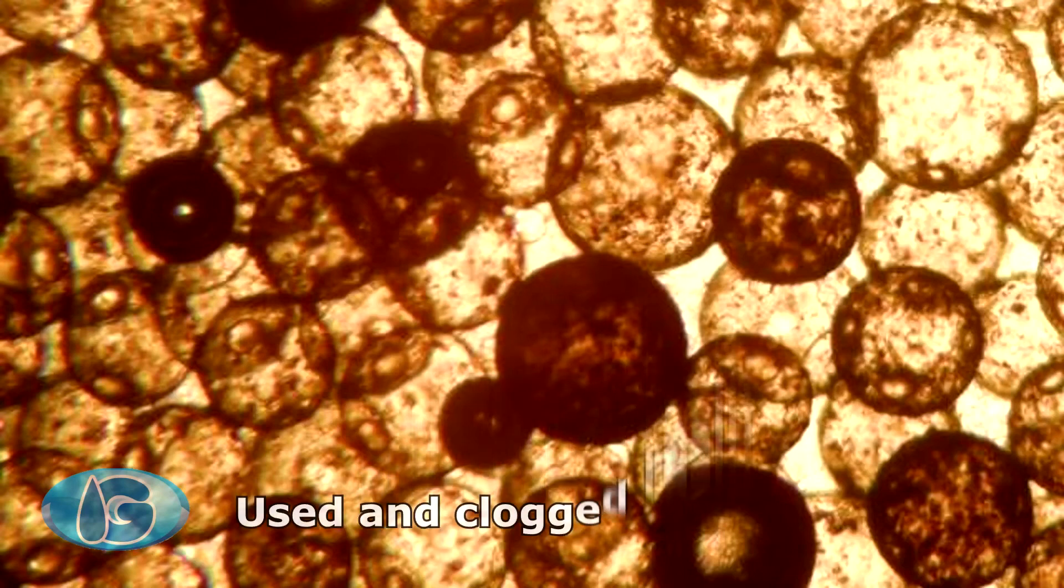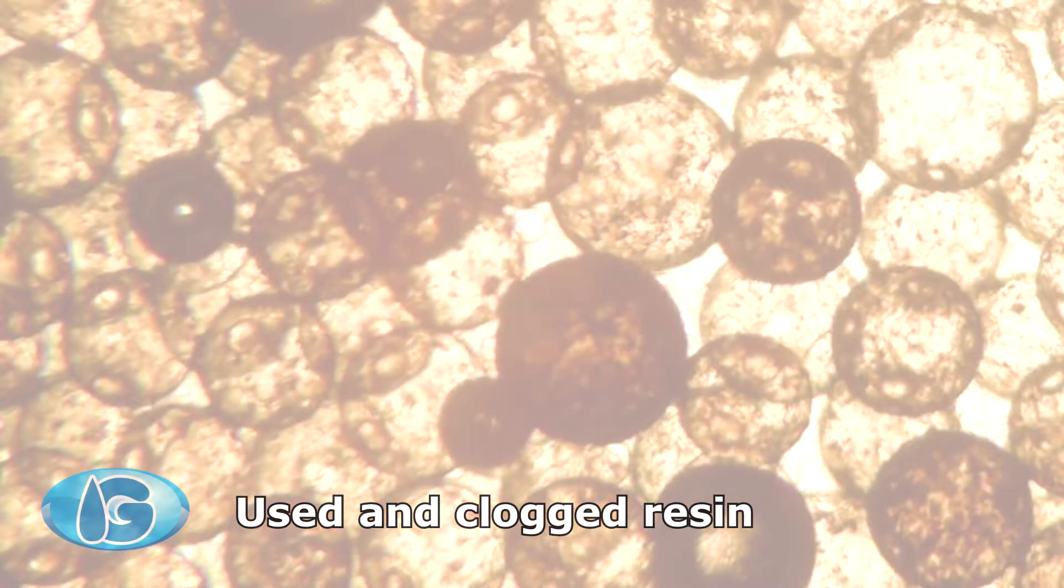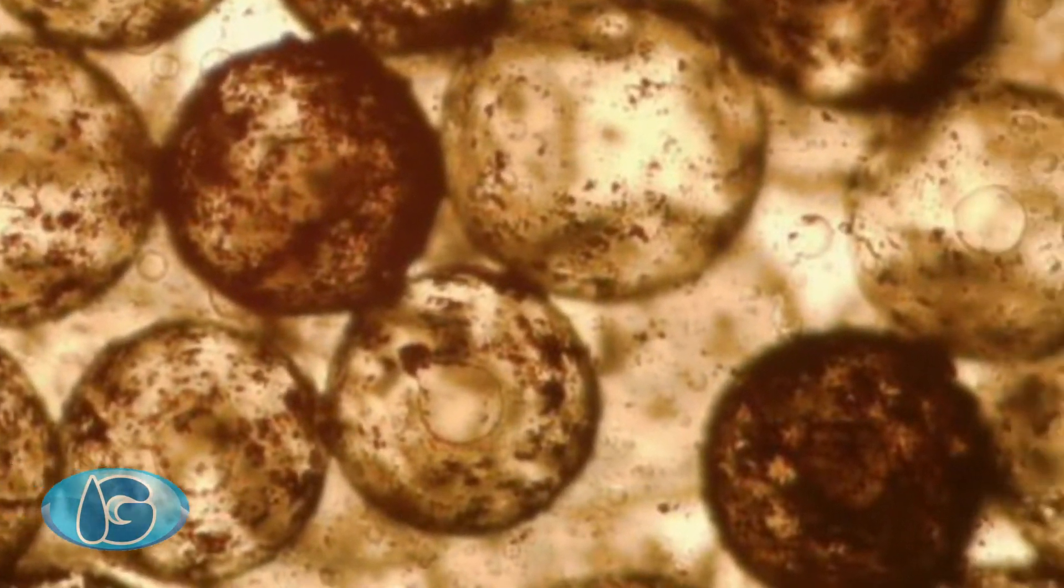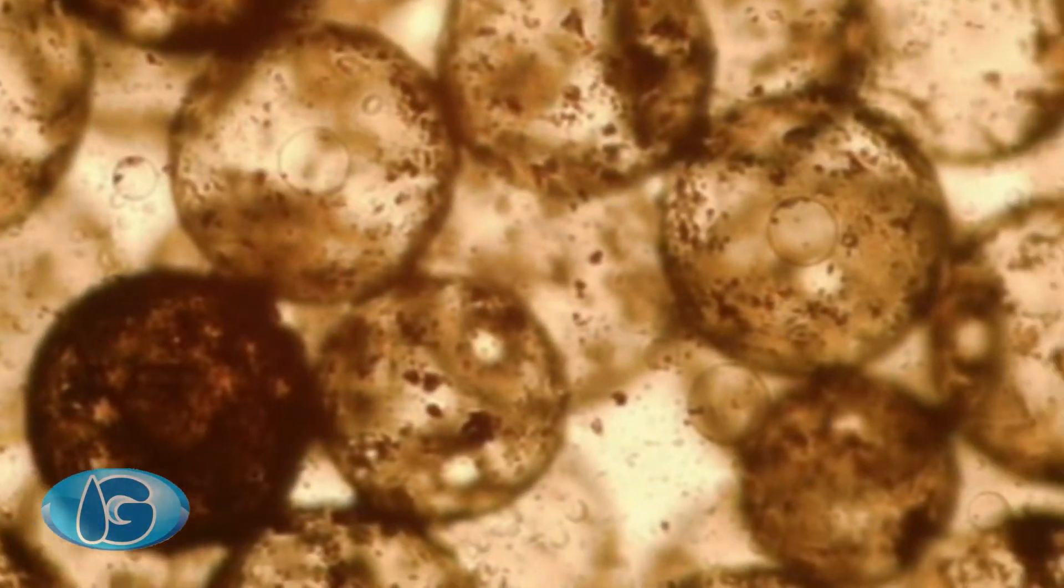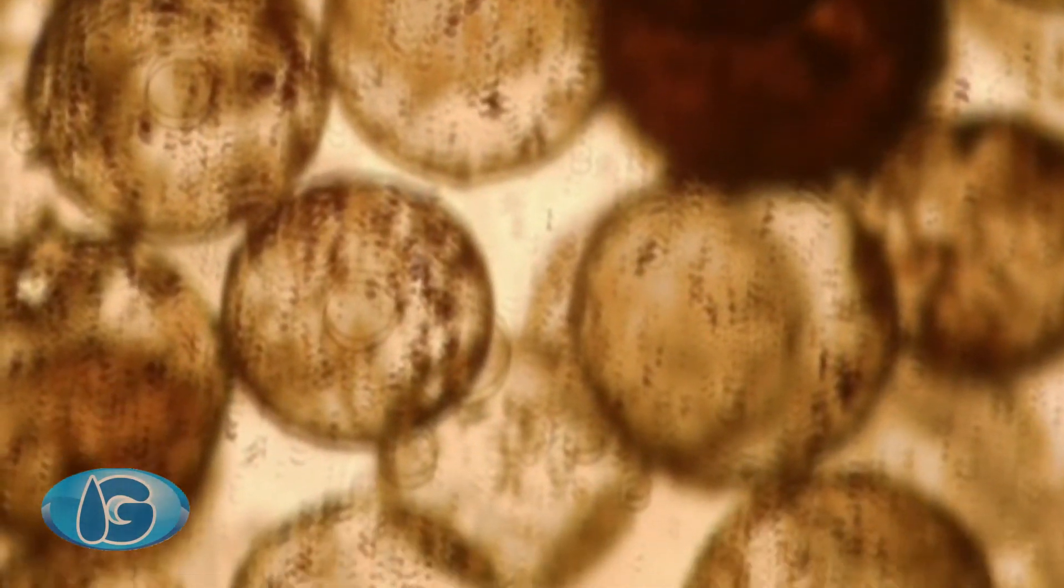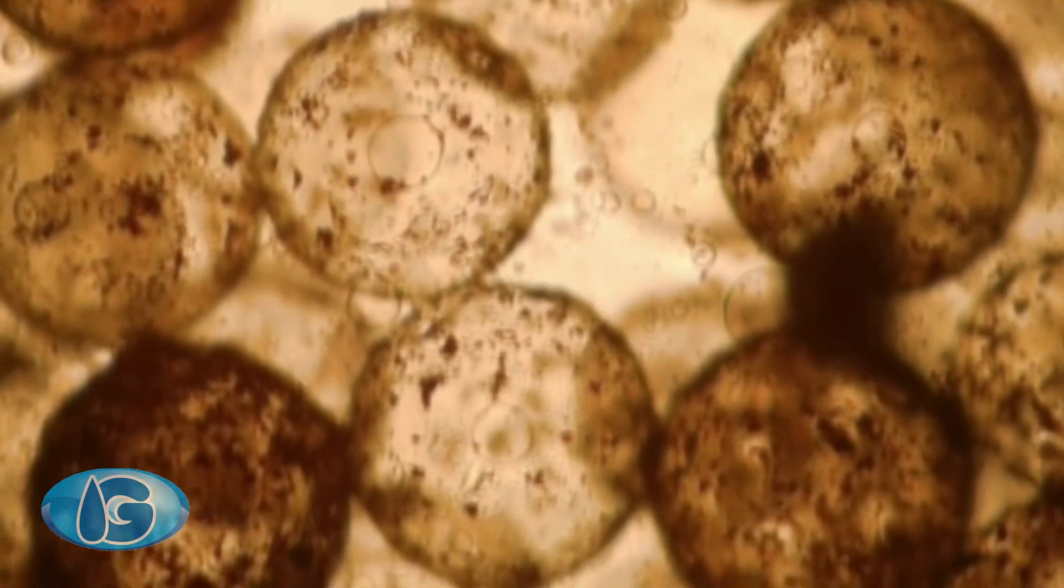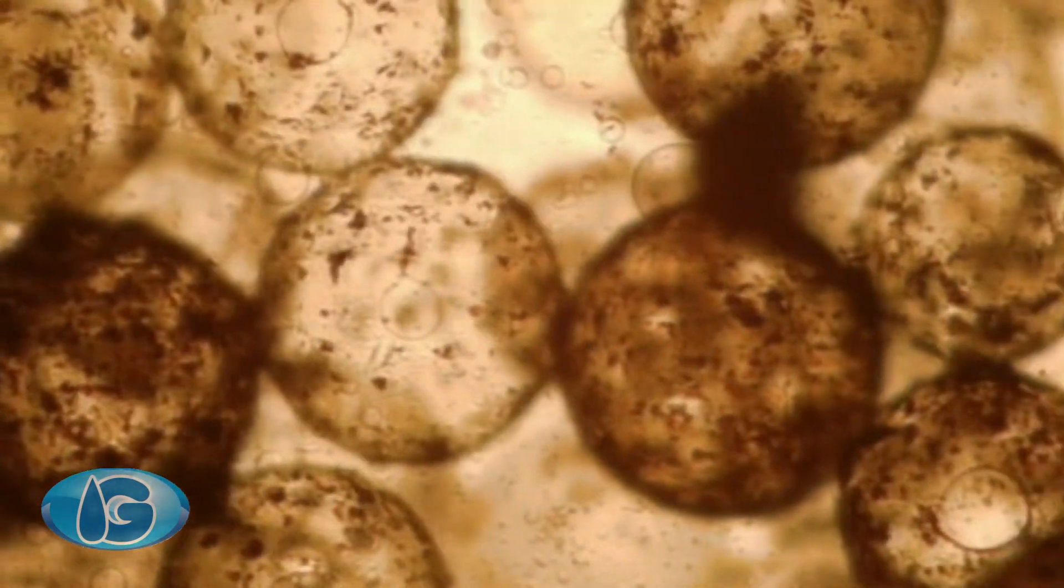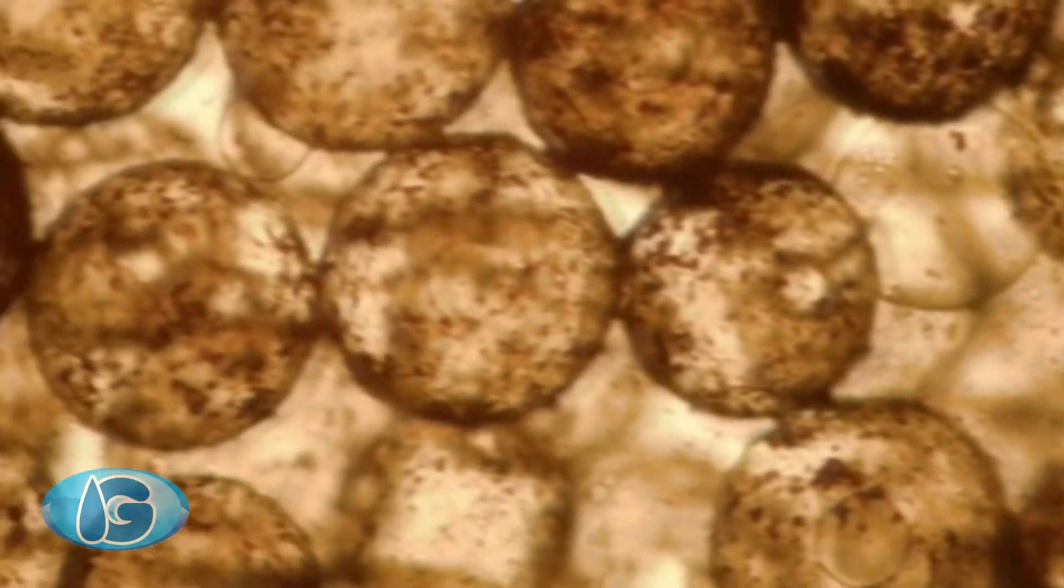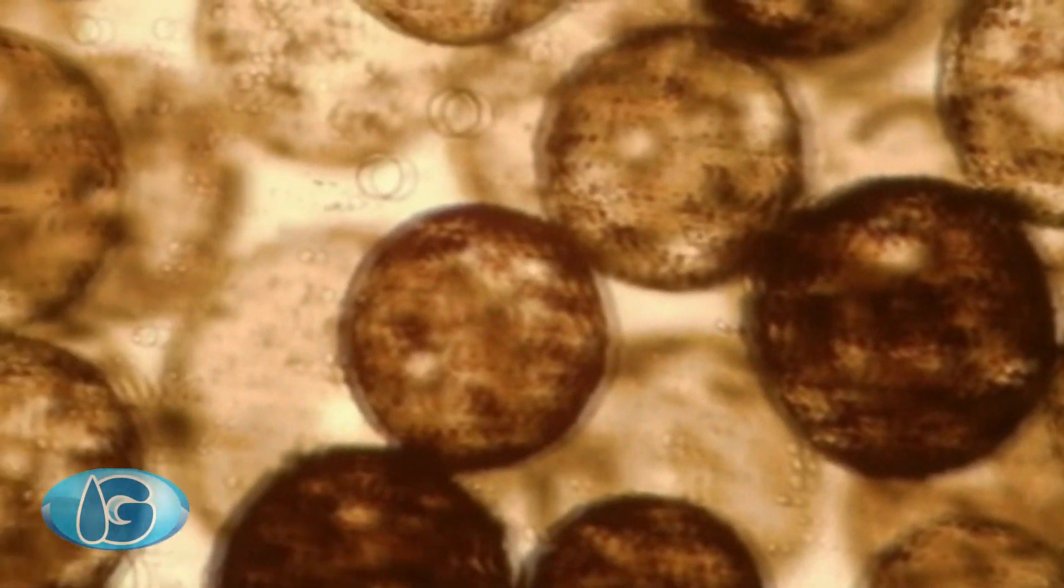Another example of clogged resins, you can see some spheres very very dark, another less dirty, taking place. So this resin must be cleaned or replaced by another new.